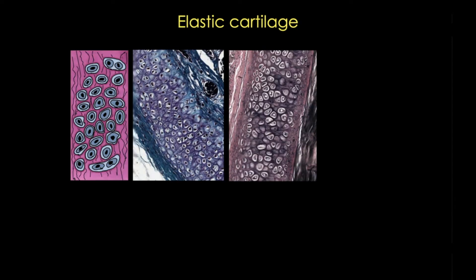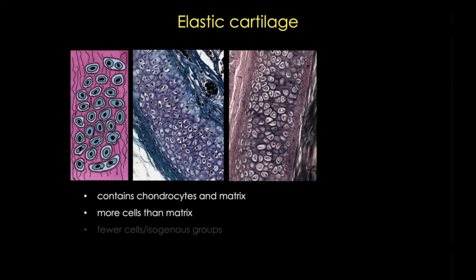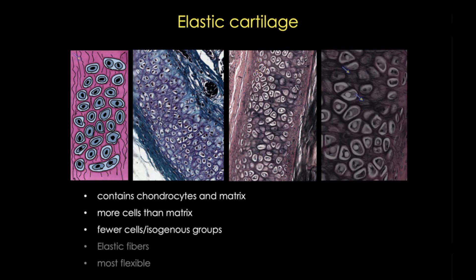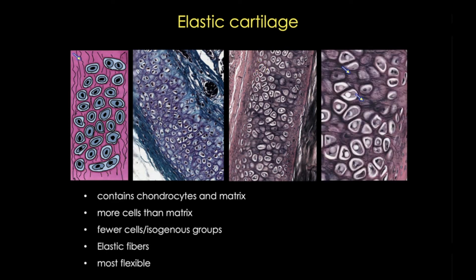Elastic cartilage also contains chondrocytes and matrix, but can be differentiated from hyaline in several ways. First, it has more cells than matrix. In fact, it has the highest number of chondrocytes of the three types, and while it does have isogenous groups, there are fewer cells per group than in hyaline cartilage. The color, as shown here, even in an H&E stain, is darker and almost duller than hyaline. But the most distinguishing feature is the presence of elastic fibers, which you can really see in this section stained with Verhoff stain, which colors those fibers black. Those fibers will also look like thin, kind of shiny threads that you can see even in an H&E stained section.